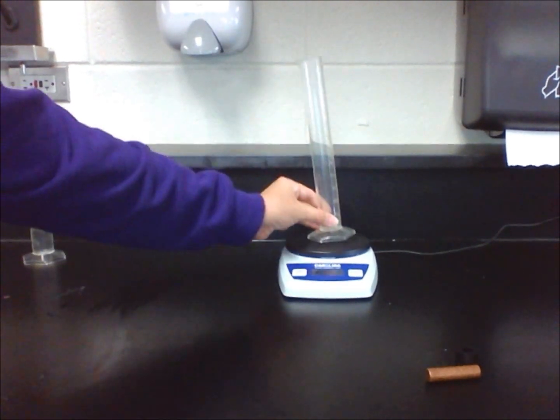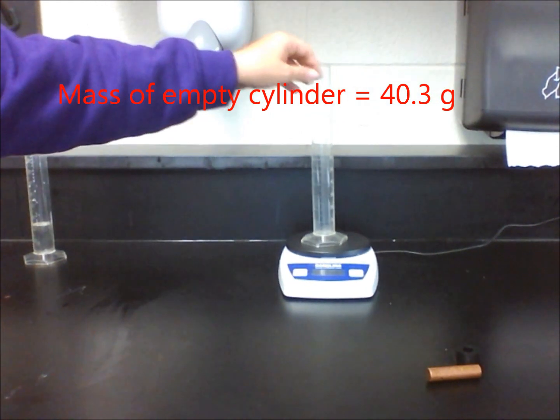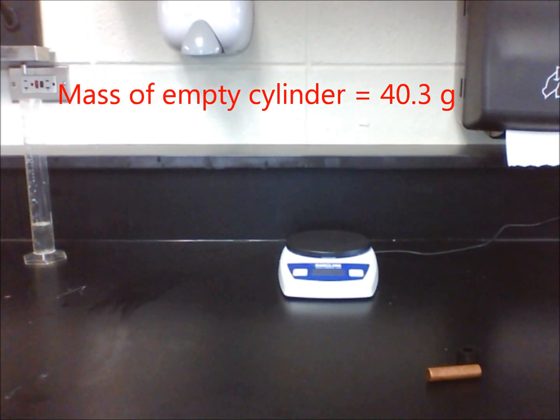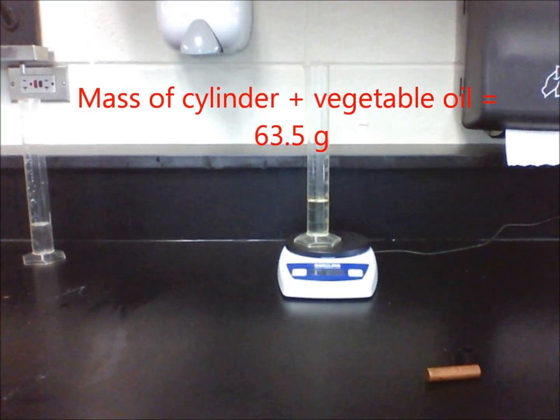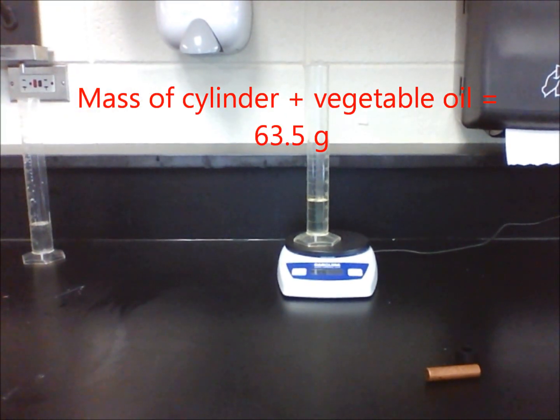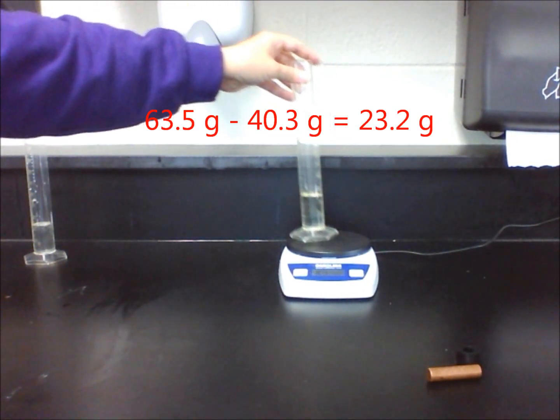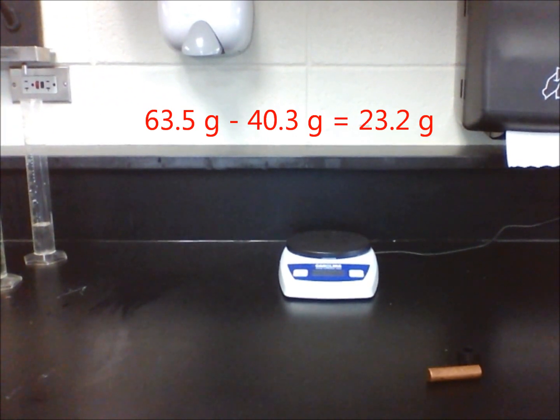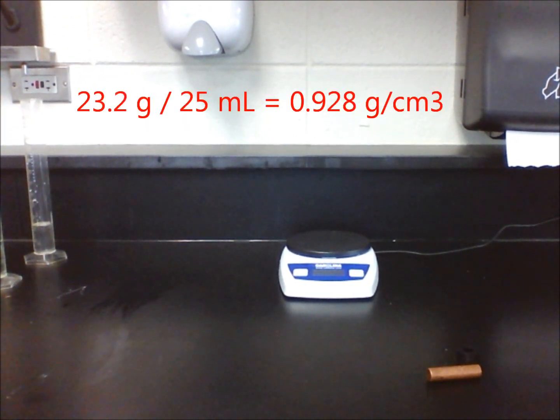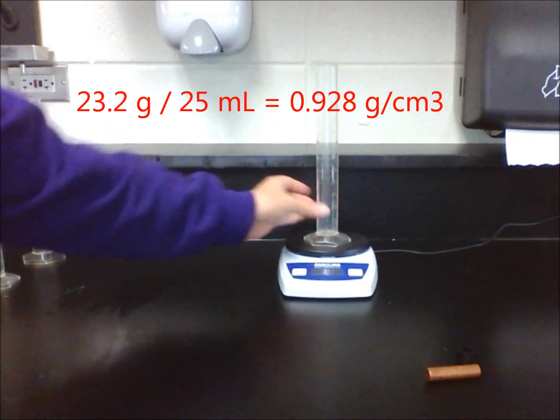Next, we need to find their mass. Mass the graduated cylinder on the electronic scale by itself. Then, after pouring 25 milliliters of vegetable oil in the graduated cylinder, mass it on the scale again. Subtract the original mass from the new mass to get the mass of just the liquid. Divide mass by volume to get its density. The answer should be around 0.93 grams per cubic centimeters.